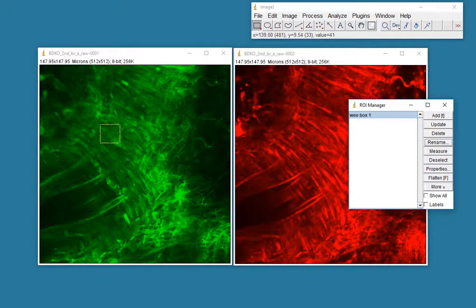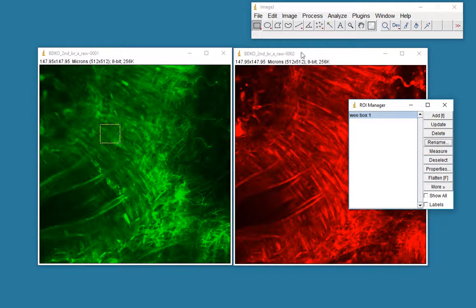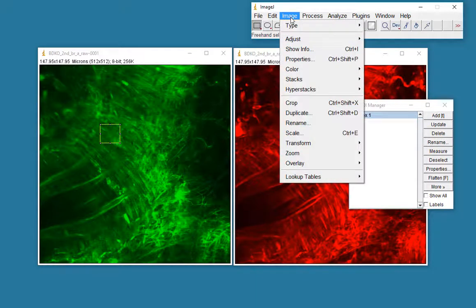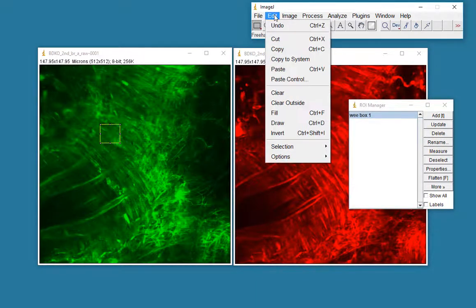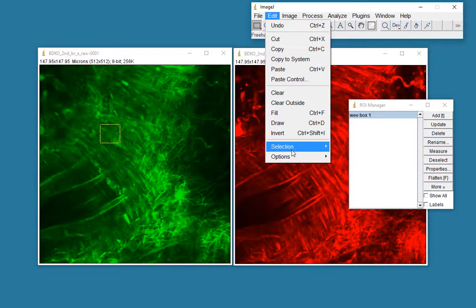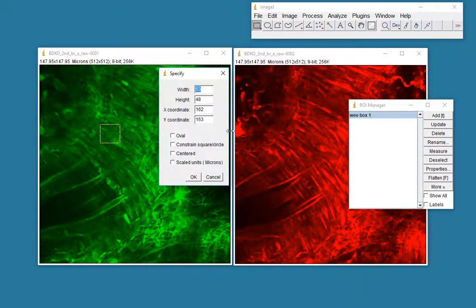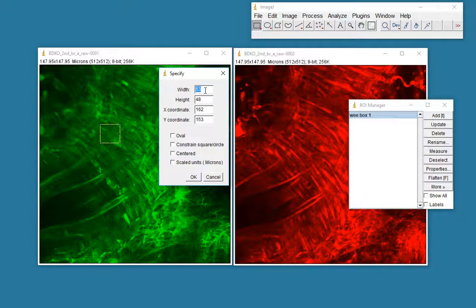Now, sometimes I might want to specify a specific size of a box. In that case, I need to find the specify option, which I think is in edit, selection, specify. And I'm going to here specify a box, which is, let's say, 100 by 100.